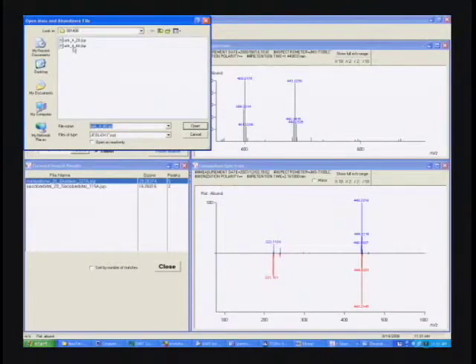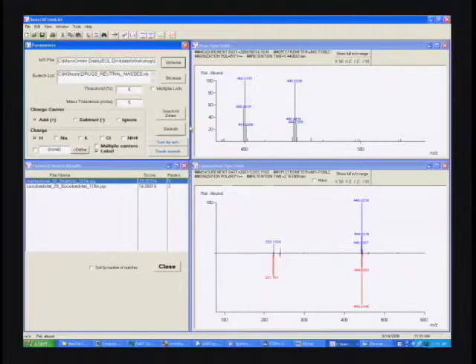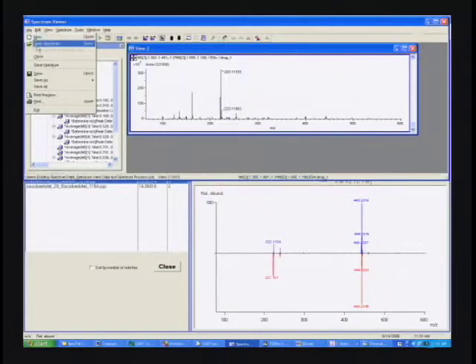Once again, I've got to make sure that we've got the right data here, which this does not appear to be the right data. Let me go back and make sure we've saved the correct data here. I know it's supposed to look like this.